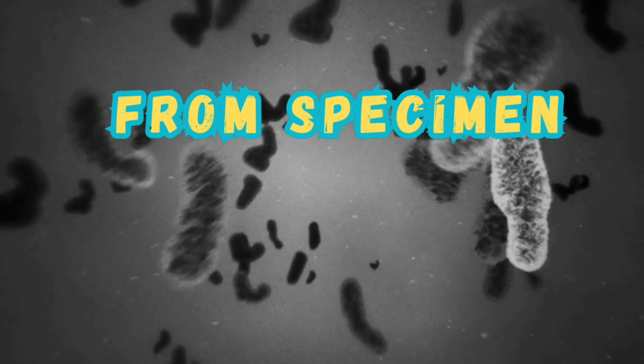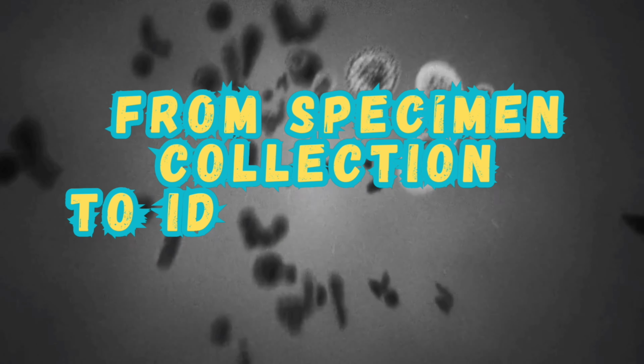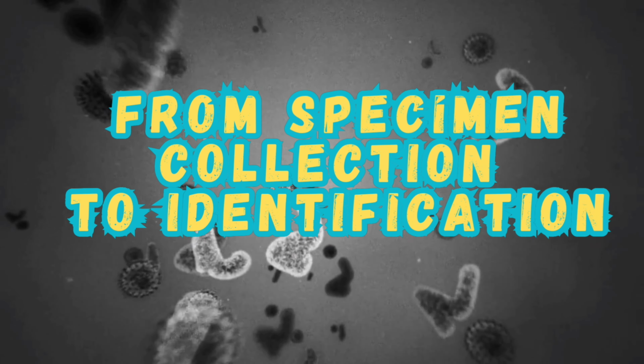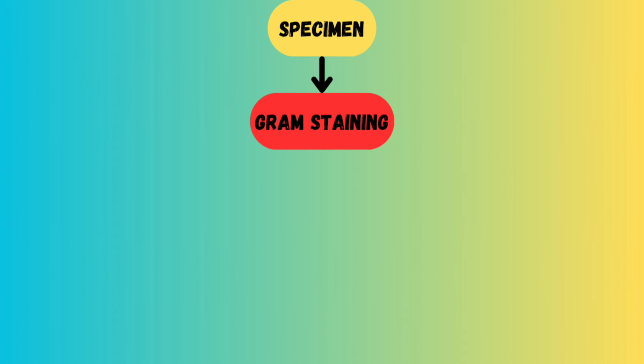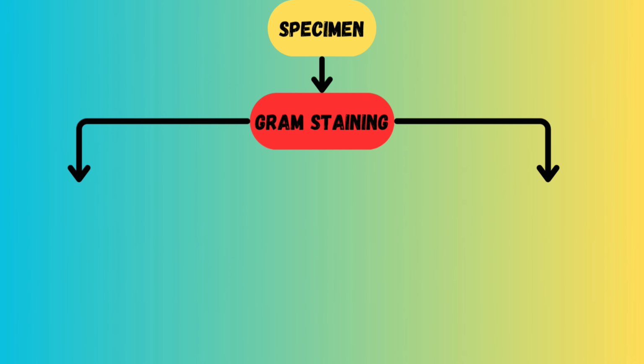Before going to discuss the Gram staining procedure, let's know the overall scenario of a specimen from collection to identification. With the help of Gram stain, we can directly detect the bacteria in the clinical specimen, whether it is Gram positive or Gram negative.